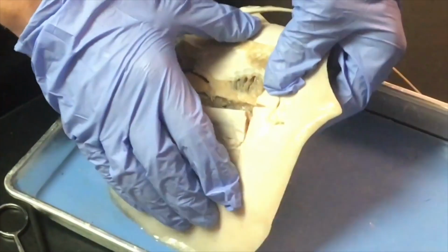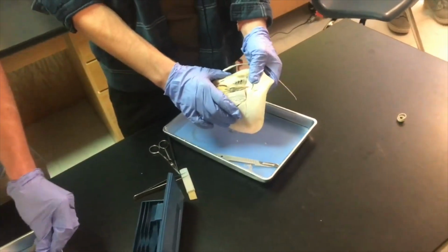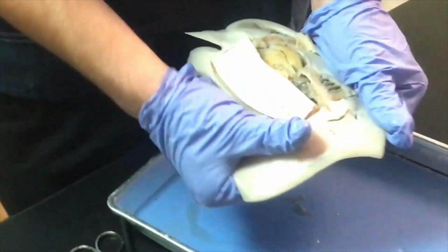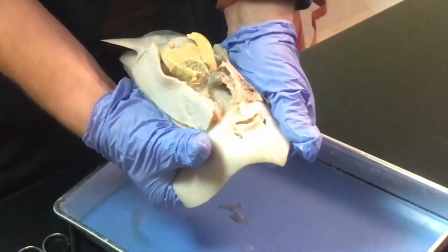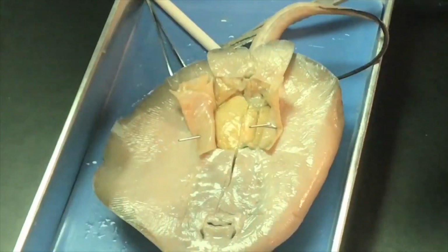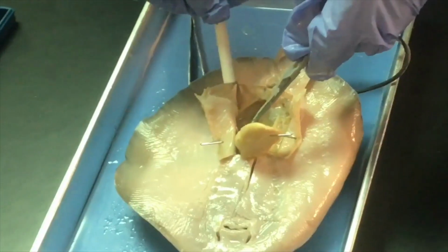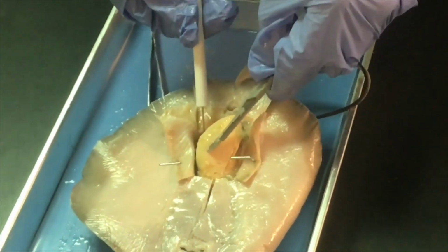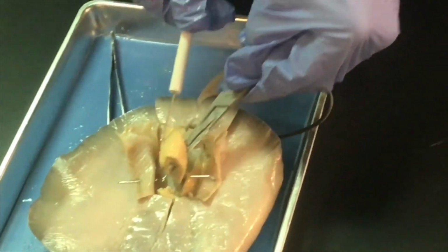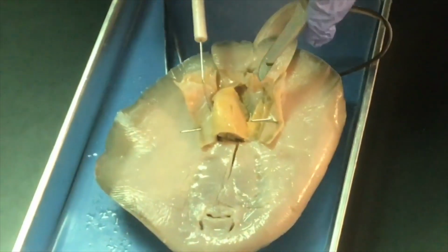You did a good job. Folded it like this? Is that what you did? Kinda, yeah, like that. There you go. Oh my god. I was told by Riley that this is what he did yesterday. He bent it. Right here, what we've got is the liver. No, that's the liver. Yeah, this thing's the liver.